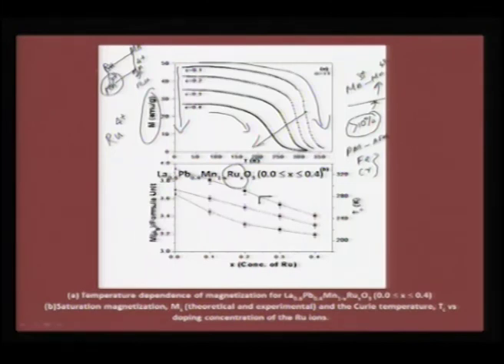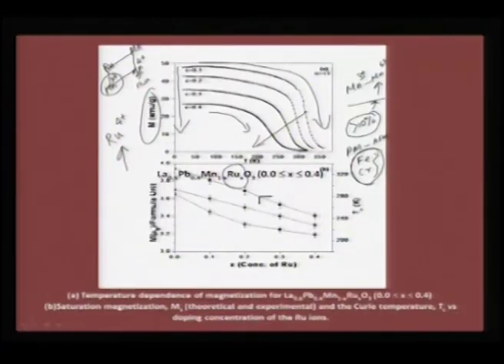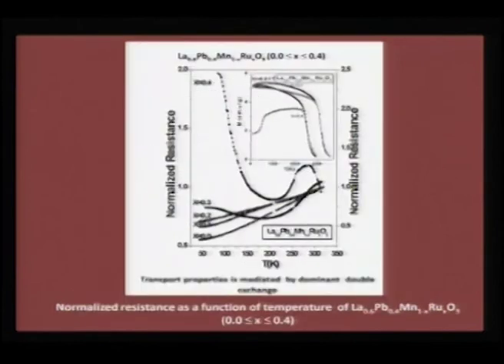So, in this case, what is happening special to ruthenium doping compared to all other transition metals is the question, and how we can use X-rays to prove this point. As I told you from the previous graph, this long range ferromagnetism is also exemplified in the plot of resistance versus temperature.